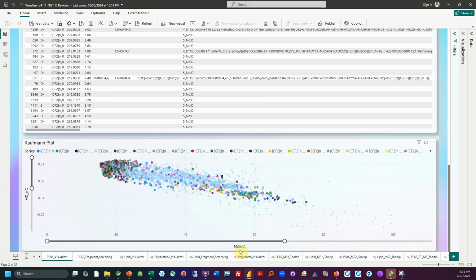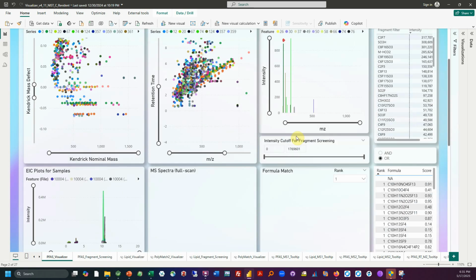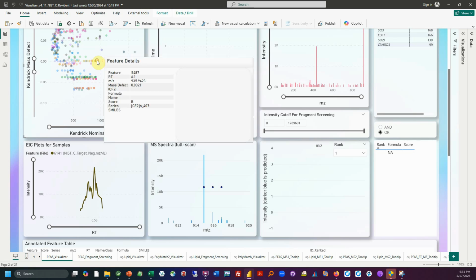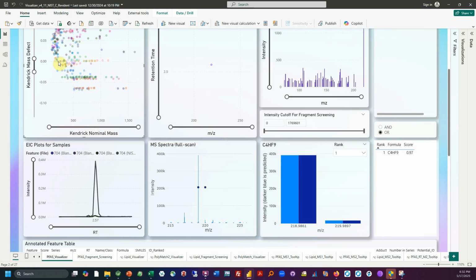For example, PFOA, which we described in the tutorial as well, is the same structure as octanoic acid except it has fluorines instead of hydrogens, but has nearly 3 times the mass. And so PFAS are going to have a higher mass per carbon, and we can get that carbon count based on the M+1. So for PFAS, if we were to select one, the M+1 is usually quite low. Let's select one over here. So here's C4HF9.